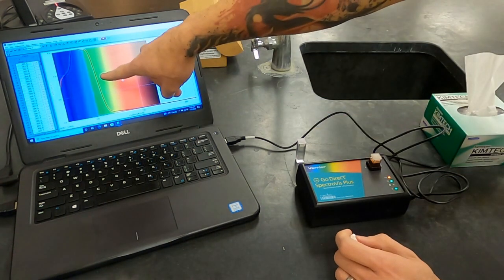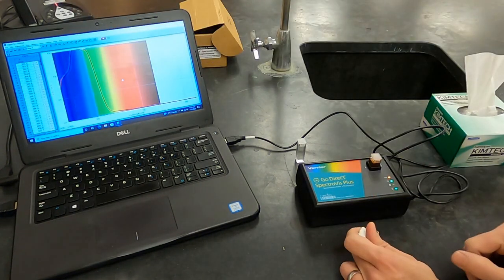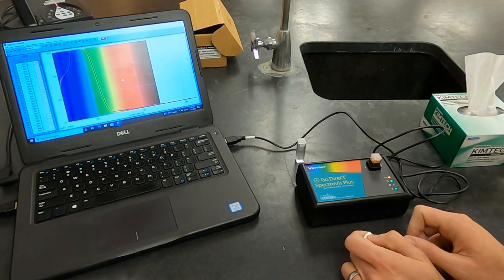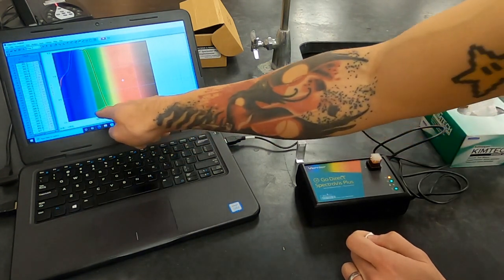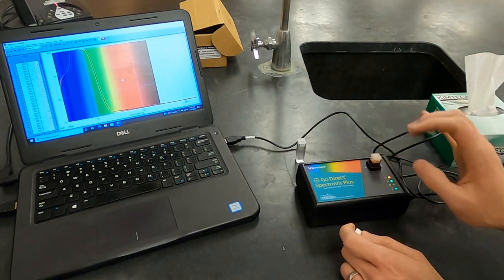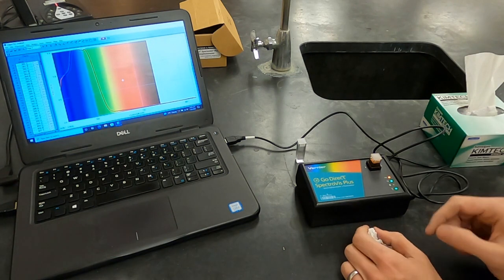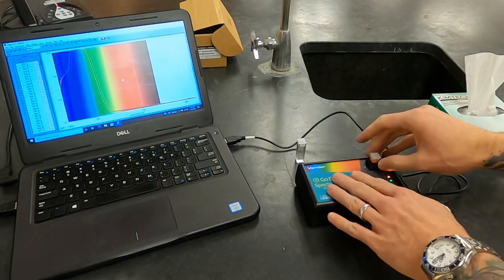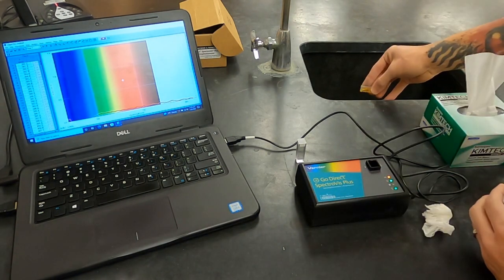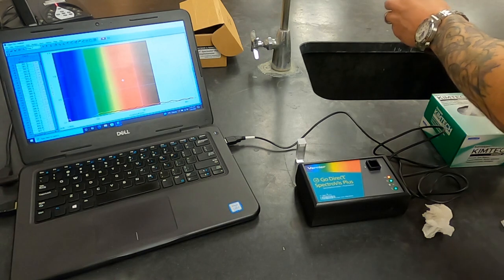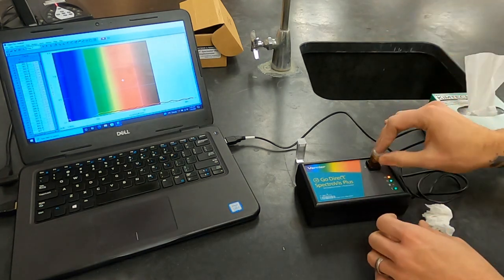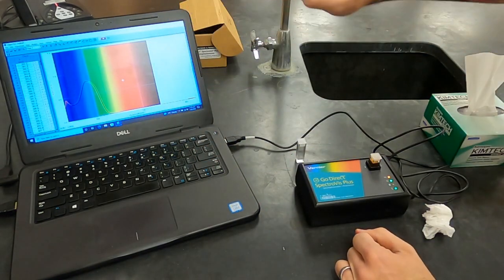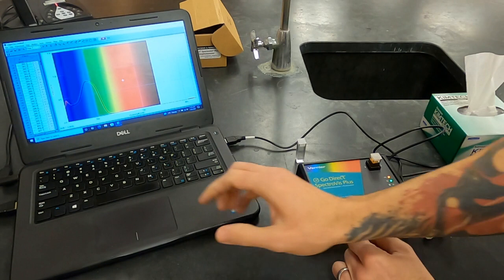Now, if this happens where the line is going off the chart, it means that it's too concentrated. And what you'll do, because it's really important to see the shape and to see where those peaks are, what their wavelength is, you're going to pour half of this out and fill it back in with water. And that's going to bring the entire curve down so that you'll be able to see the actual shape and the peaks. So now we can actually see the shape of the absorbance for yellow five. And this is where we would want to hit stop.